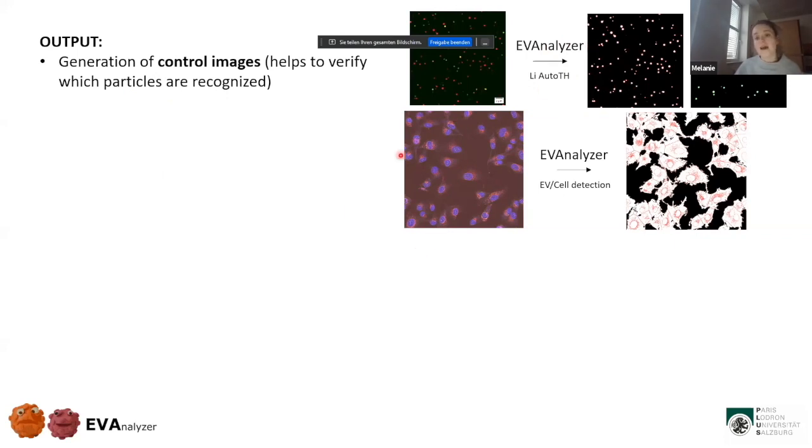Here you see the image of a cell uptake, and this is how it looks after the processing steps or after the pipelines done by EVAnalyzer.